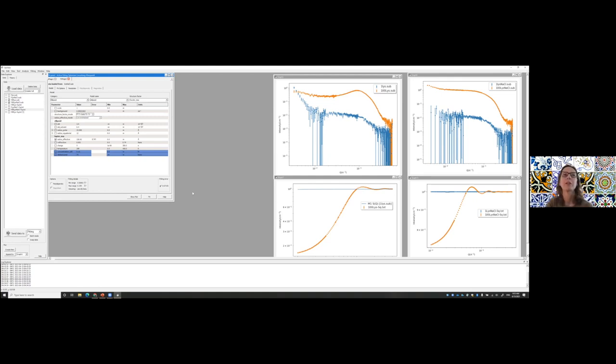If you don't know a lot about structure factors, you're just approaching this, you've never looked at structure factors, you don't know what the software has to offer, then you can click on the options and it shows you the ones that are already preloaded. It will show you there's a hard sphere, there's a Hayter MSA, which is the one we're using now, there's a square well, and there's a sticky hard sphere. There are more sophisticated structure factors out there, and we could introduce them here, but these are the four that are available at the moment.